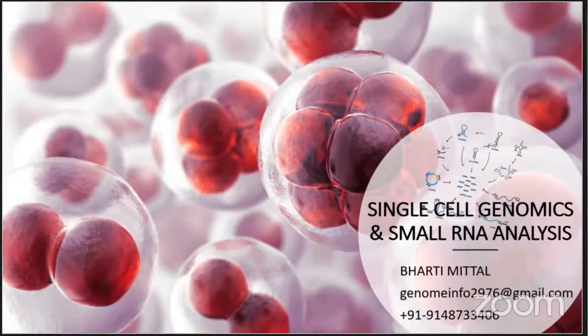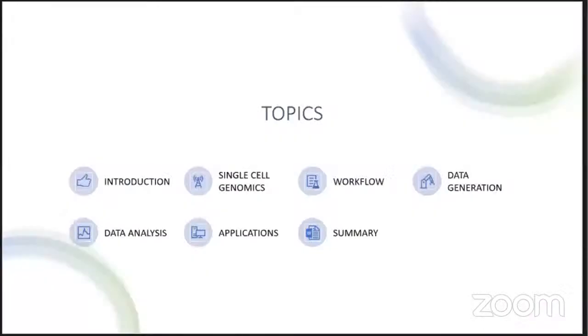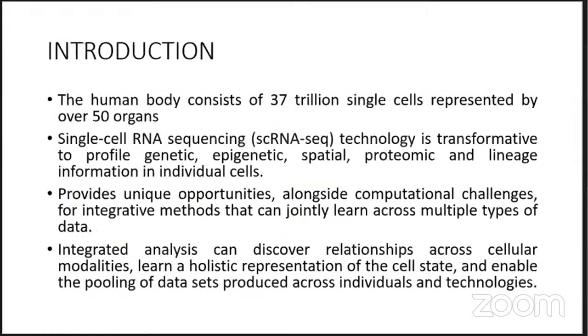So in today's session we will be covering the introduction, single cell genomics, workflows which can be used for single cell and small RNA, library preparation, as well as data analysis, how to generate the data, various kinds of applications, and we will summarize with some hands-on session. So let's begin for today.